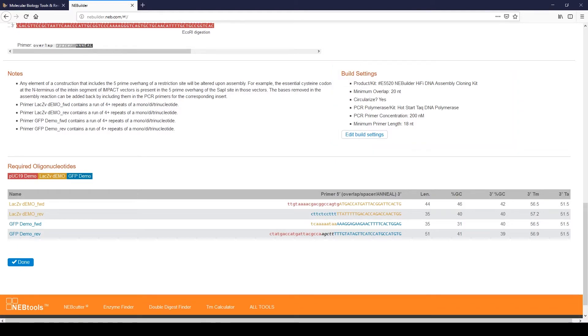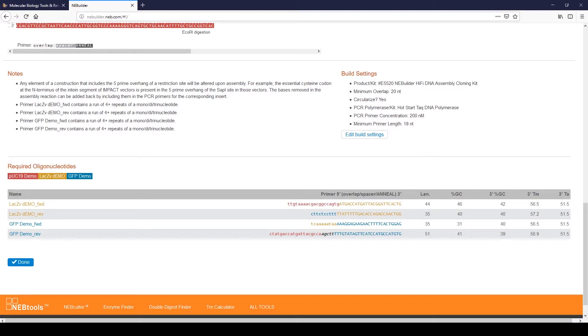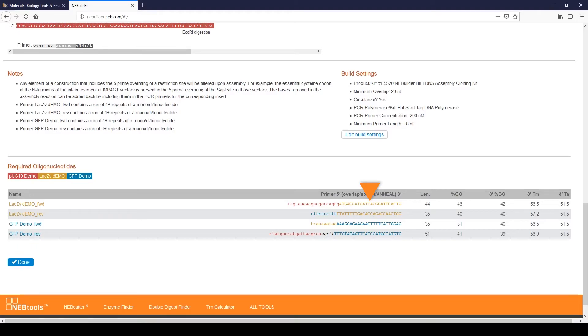Scroll down to the required oligos field. Each fragment generated by PCR has a pair of oligos. The 5' end of each oligo, seen in lower case, contains the overlap sequence for the adjacent fragment in the assembly. The 3' end of each oligo, seen in upper case, contains the PCR primer portion of the oligo.